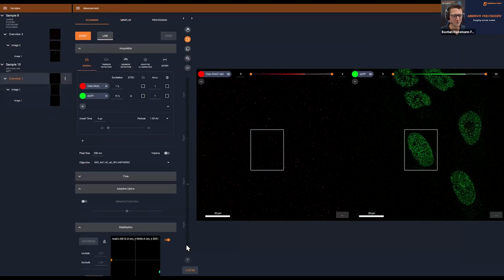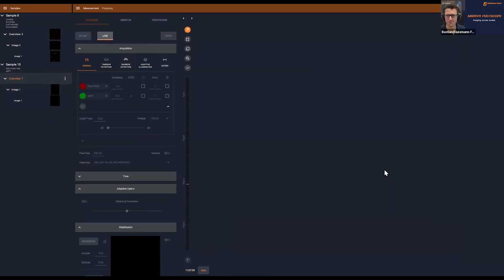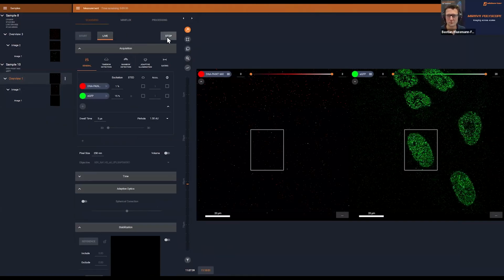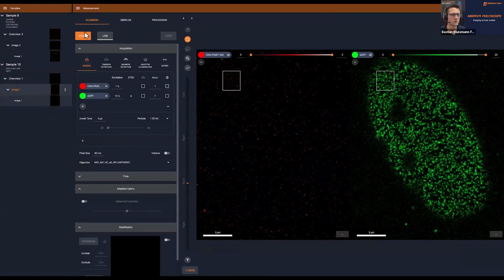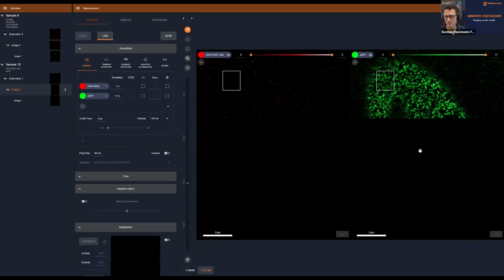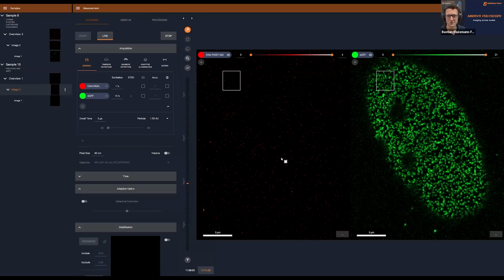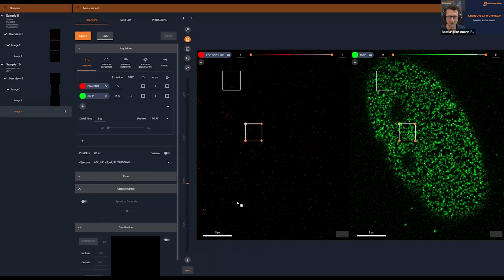Go here for live. Maybe let's take a new ROI, just like this. Activate our stabilization unit.